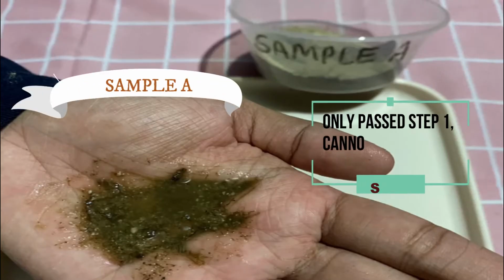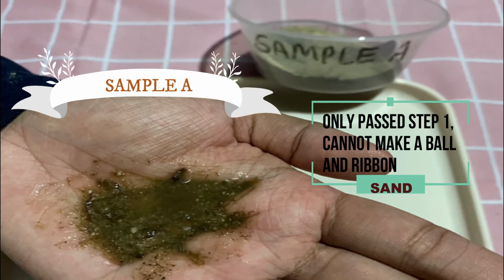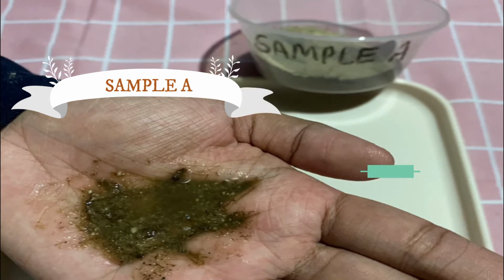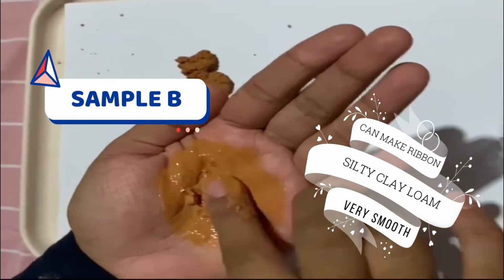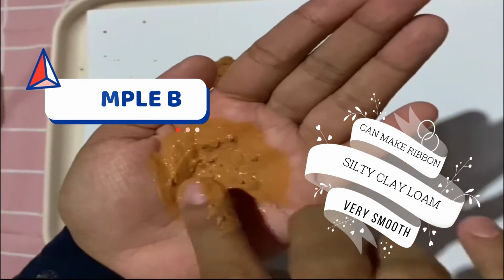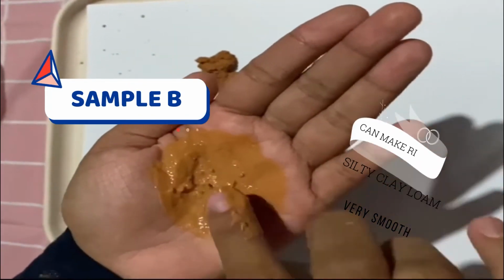Sample A is sand because it only passed step 1. The soil cannot form a ball because the texture is very gritty. Sample B is silty clay loam as it passed steps 1 until 4 and formed a ribbon more than 2.5 cm in length, which is very smooth.